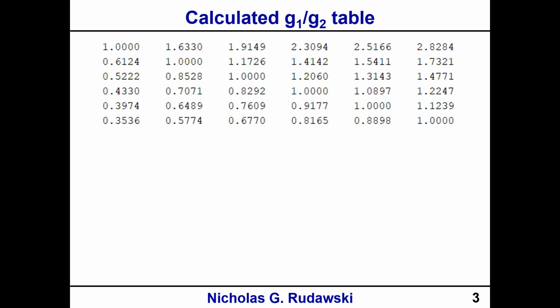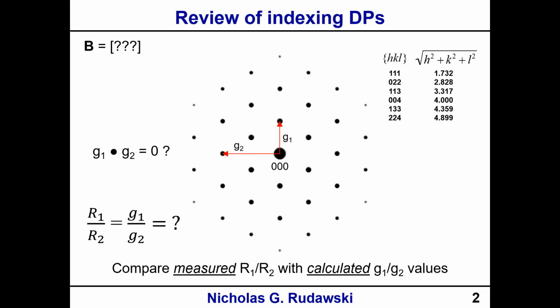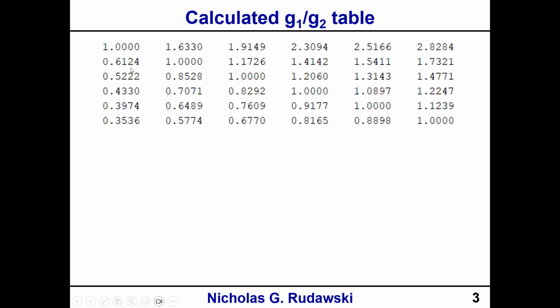Then what we're doing is dividing that G vector by all the other G vectors in the list. We take this G vector length and divide it by itself first, which gives us 1. Then we divide it by the next, which is less than 1, then the next, a little bit less, and then the next, a little bit less. Basically, every other term beneath the first one will be less than 1, and it will be decreasing. That's exactly what we see here.